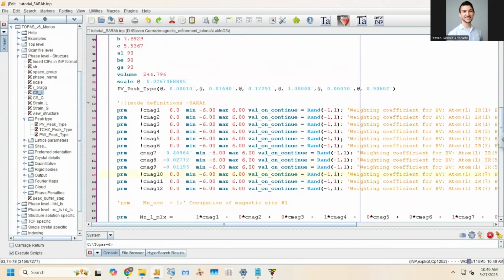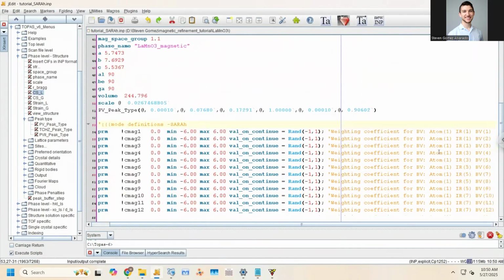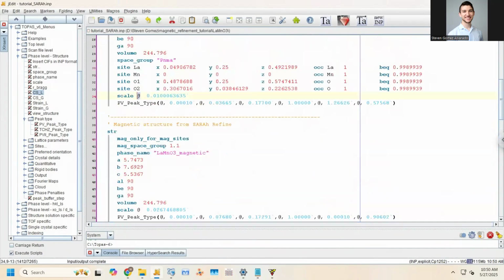All right, so this is a working version. I'm just going to reset all these back to 0 so we can see what we're dealing with here. There are two ways to approach this. One of the ways is you can go through and refine each irrep one by one. So here's all three basis vectors, basis vector 1, 2, and 3 for irrep 1. So this is gamma 1. So what that would look like is I'd take this guy. Ooh, wait, actually, I realize there's an error here. I need to keep the same scale factor.